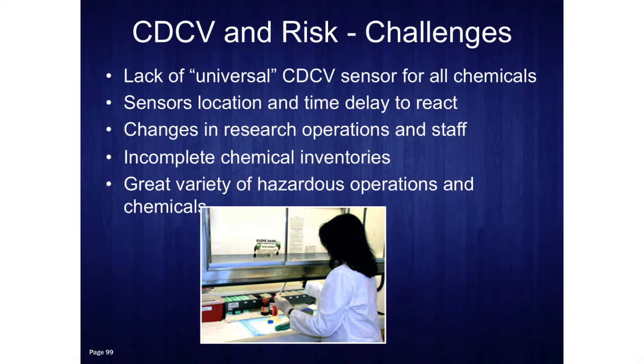I mean, the sensor suite is not going to capture everything. The sensors are located very far away from the breathing zone of the occupants. So as EH&S professionals know, that's not necessarily giving you a representative idea of what lab occupants might be being exposed to. And also there is a time delay in increasing the air when air is required.